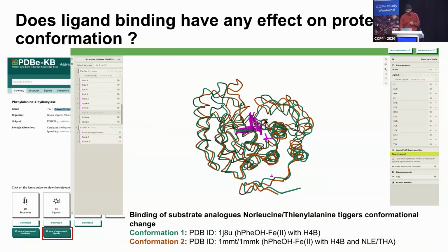And in this case, let's see how we can understand more about the conformational difference. It doesn't say what caused the conformational difference, but at least it gives you a direction. Okay, there is a conformational difference, and should I be investigating more? Should I be interested in that?